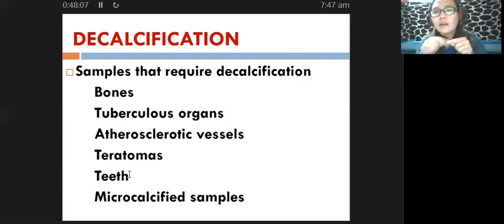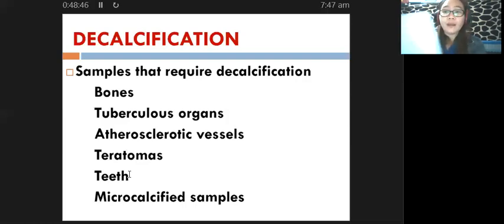How are you going to saw your teeth samples? They are very small, but they are very hard. So how are you going to make use of your fretsaw? Remember the fretsaw, you have to grab it like this. It's laborious, it takes a lot of effort. Later on, the sample that you will be cutting might be too small, or it might be too big. So that's why for our teeth samples, because they are small but very hard, they are difficult to handle in the laboratory.